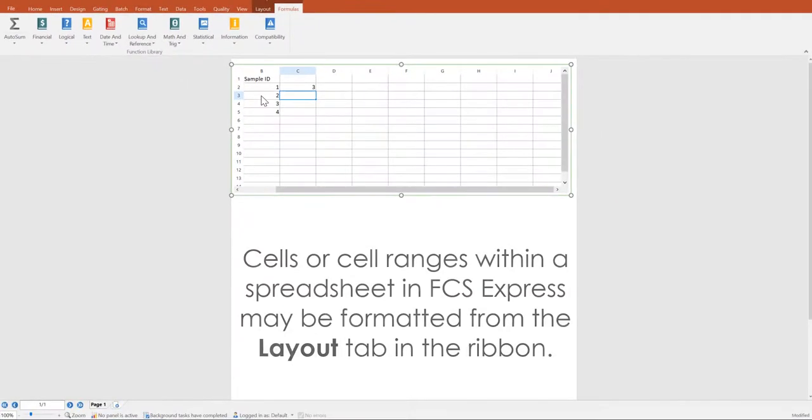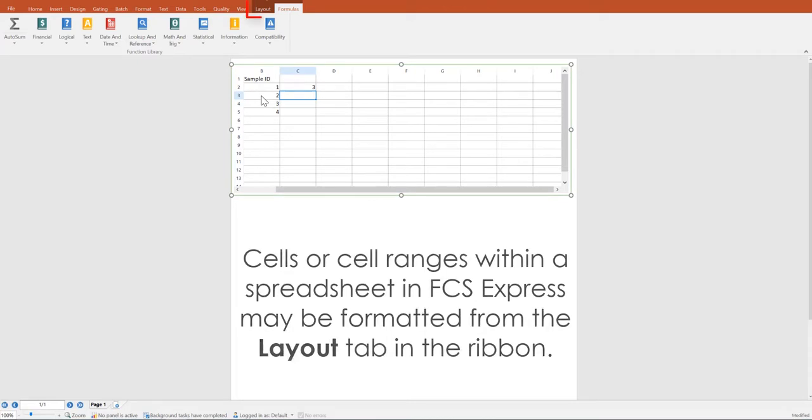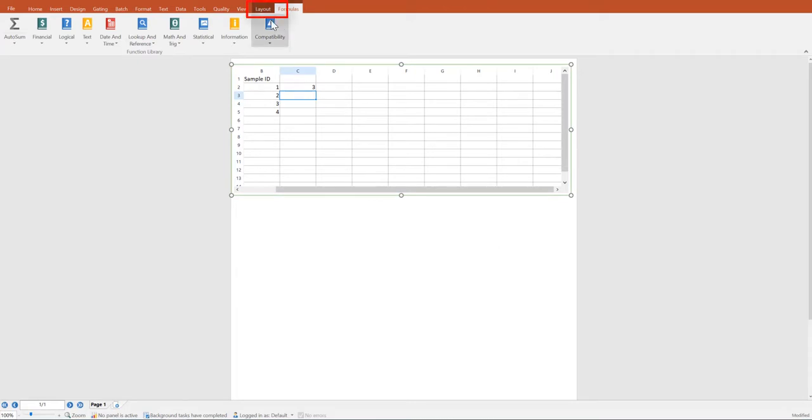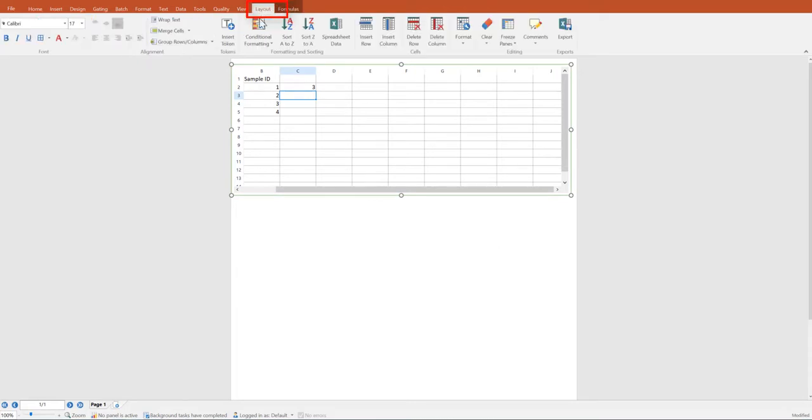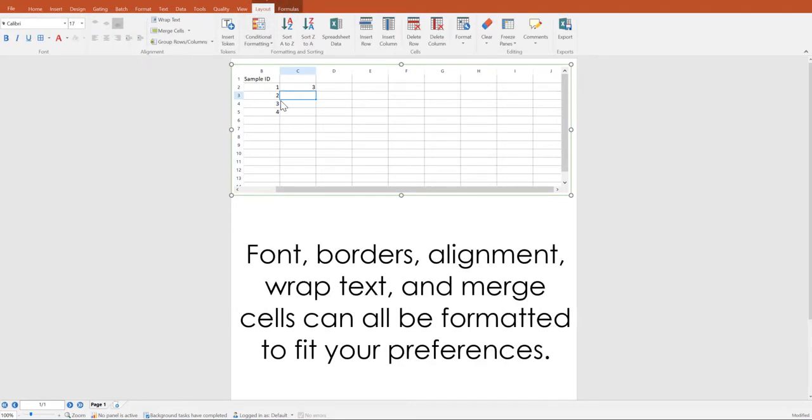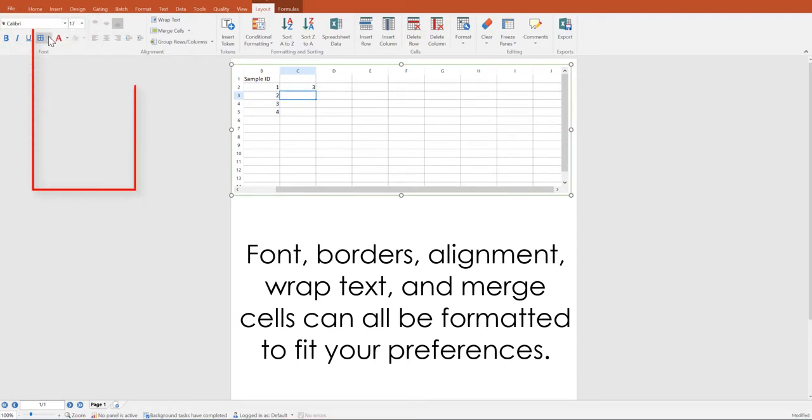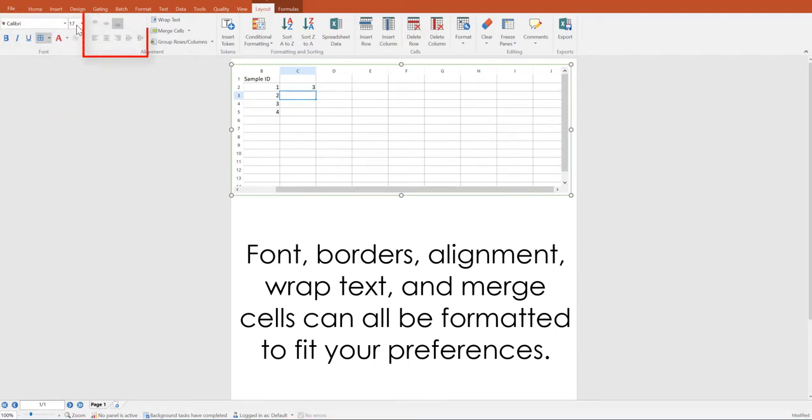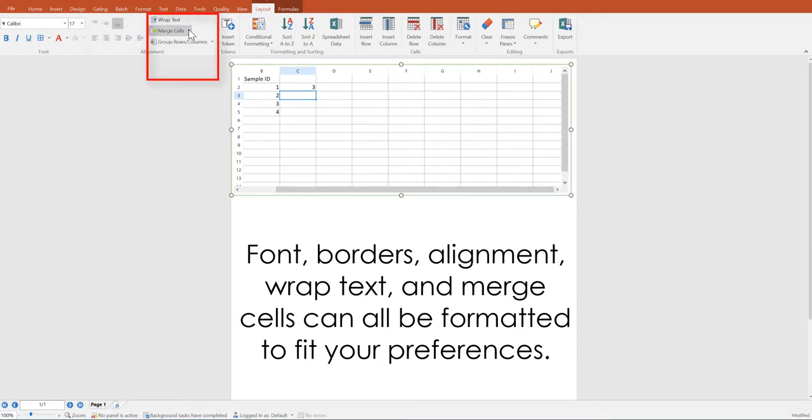Cells or cell ranges within a spreadsheet in FCS Express may be formatted much as spreadsheets in Microsoft Excel from the layout tab in the ribbon. You can see here you have the ability to adjust the font, add borders, adjust the alignment, merge cells, or wrap text.